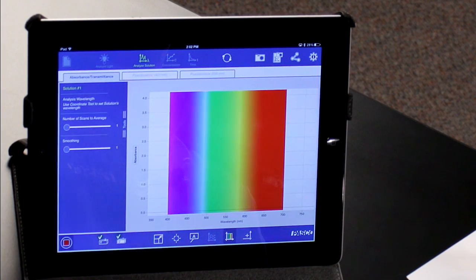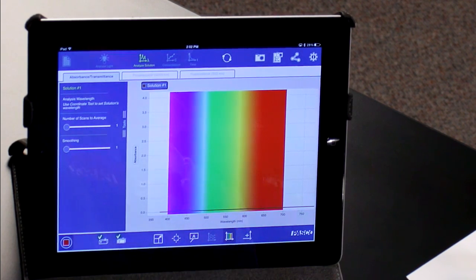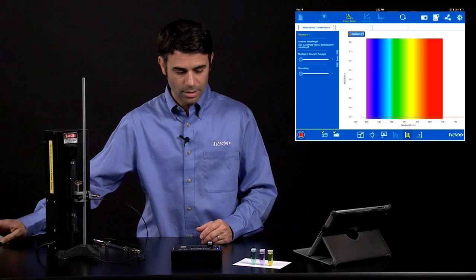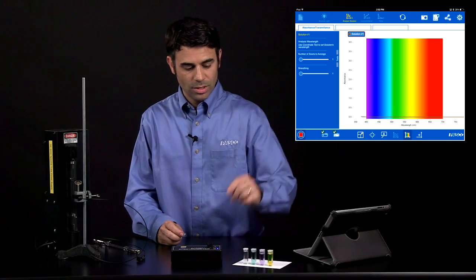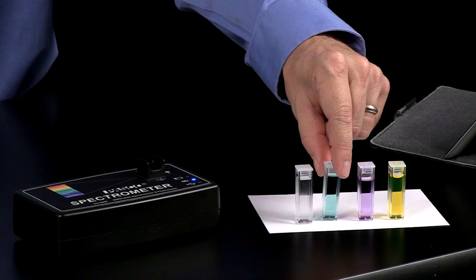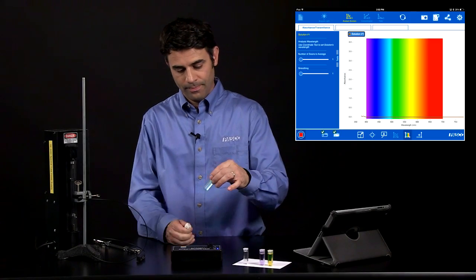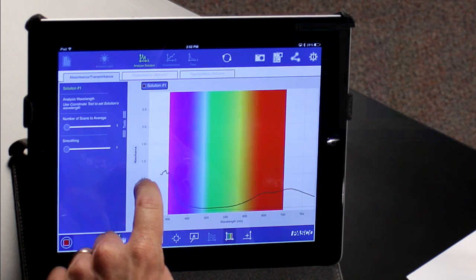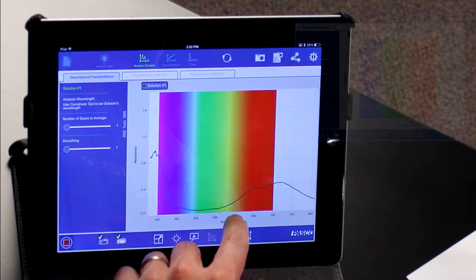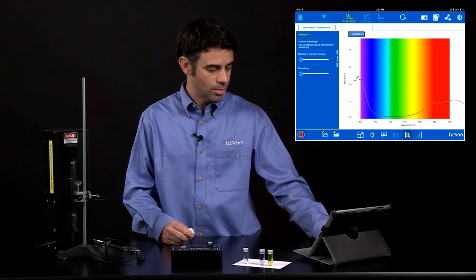If I hit start right now, then I should see an absorbance of zero because I have successfully blanked this solvent. So now if I put some solutions in there where there are colored solutes, we should see a difference in the spectra. I'm going to wipe down my cuvettes to make sure there's no smudges, and there's a nickel-2-nitrate spectra. I'll stop that.